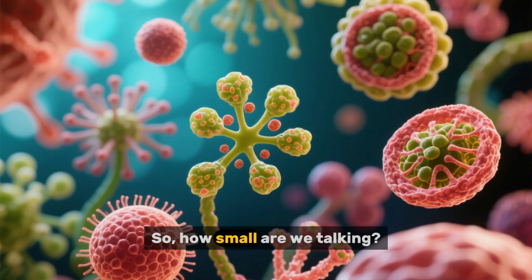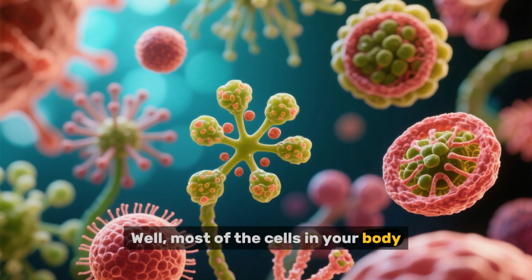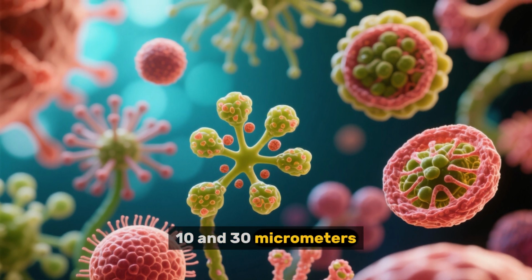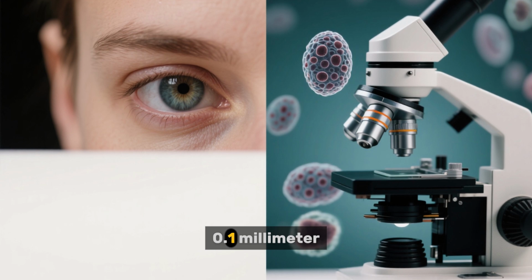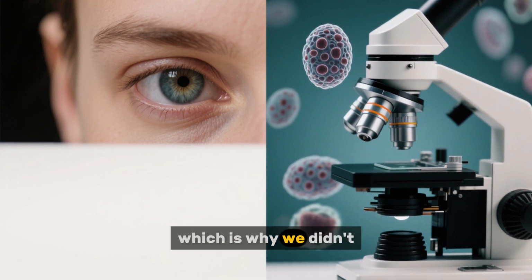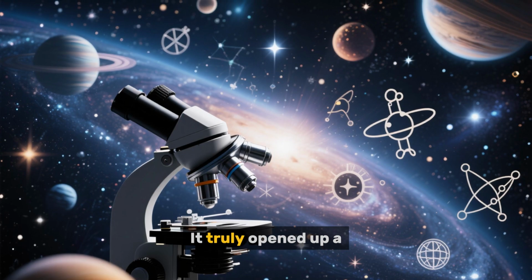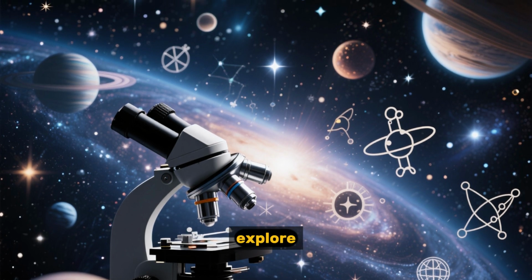So, how small are we talking? Well, most of the cells in your body and in the plants around you are somewhere between 10 and 30 micrometers. That's way smaller than the 0.1 millimeter limit of our eyes. Which is why we didn't even know cells existed until the microscope was invented. It truly opened up a whole new universe for us to explore.